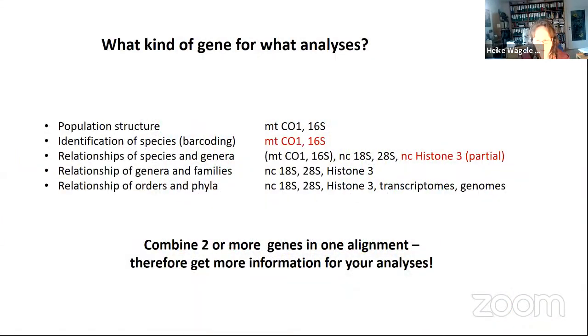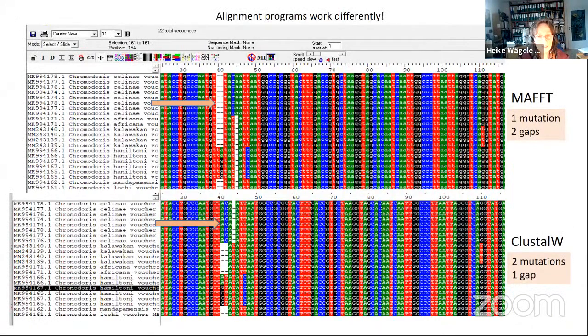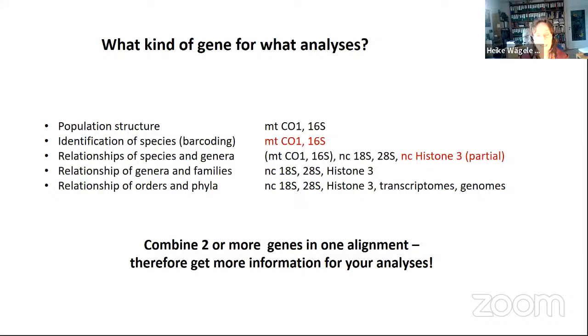So you have already an alignment of 1 gene. You have seen this is very easy. When you have gathered the assembly of all your own sequences, including the NCBI sequences, then you only use the program. Hopefully, we had some issues yesterday with a really large data set, but with a smaller data set you usually should not have any problems. And then you have already an alignment.